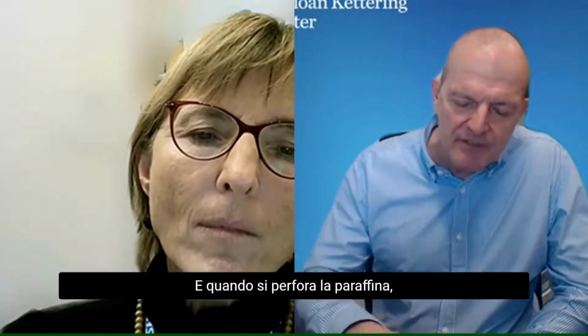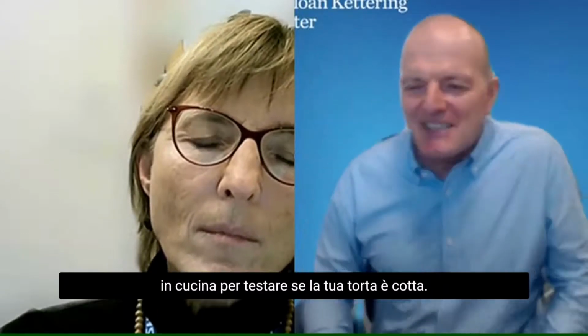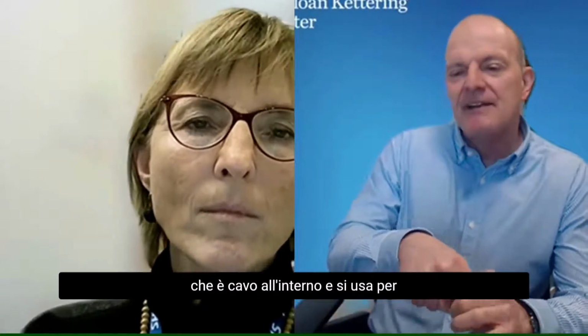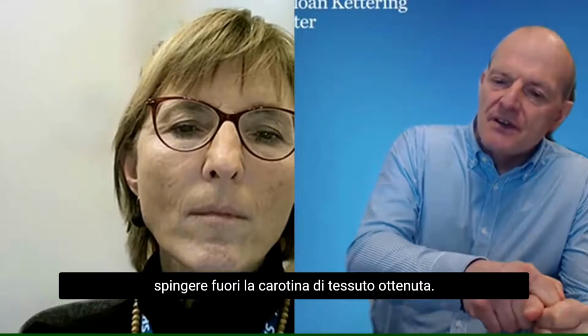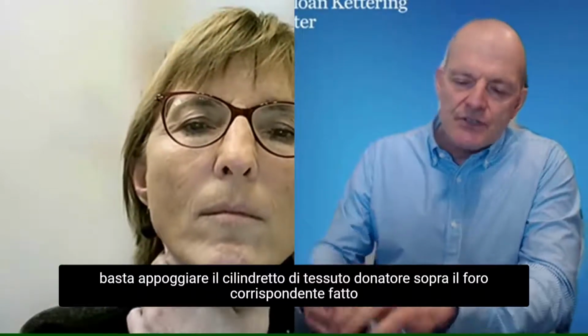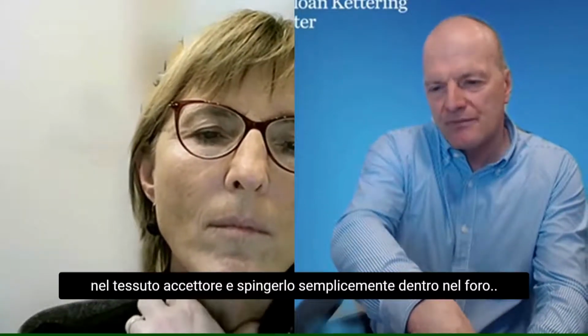You just discard them. And when you punch out the paraffin, usually the core is stuck in this device. And we have a small needle that you normally use in the kitchen to test whether your cake is done. It was our cheapest lab equipment. It was 75 cents when we bought it. And it goes right through the punch device from the back, which is hollow inside. And you push out the core. And the core, normally when we extract it from the donor tissue, we just put on top of the hole of the acceptor and just push it into the hole.